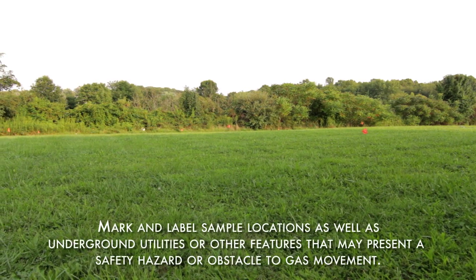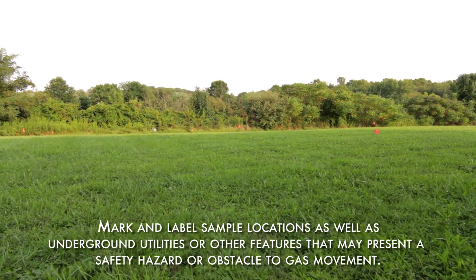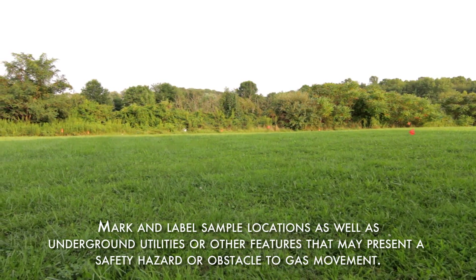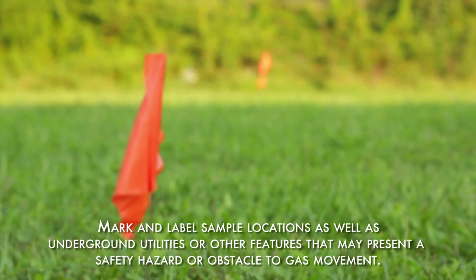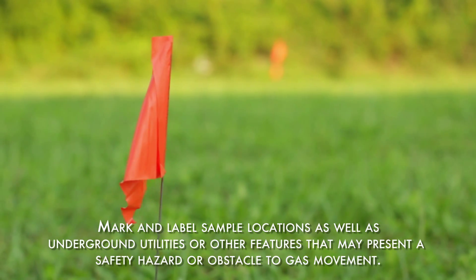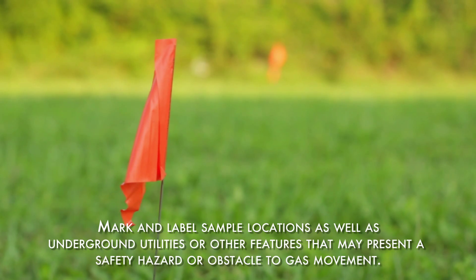Prior to beginning sample collection, mark and label the sample locations using pin flags, wooden stakes, and/or spray paint. Also make sure to locate and mark any underground utilities, pipes, tanks, or other features that present either a safety hazard or an obstacle to gas movement.